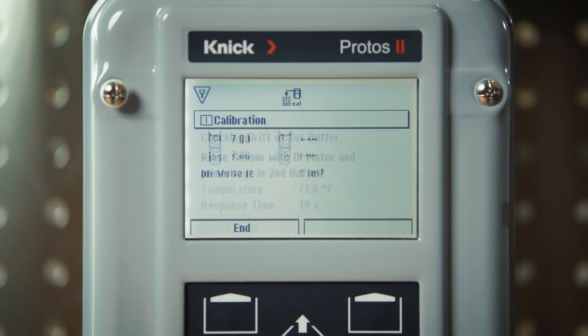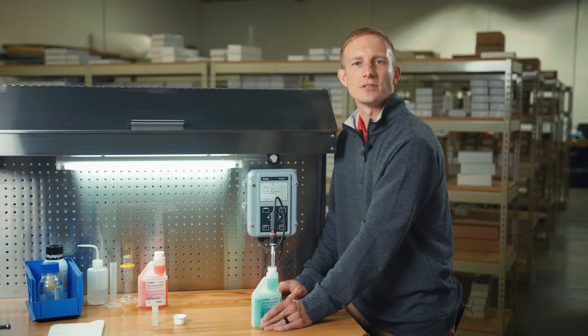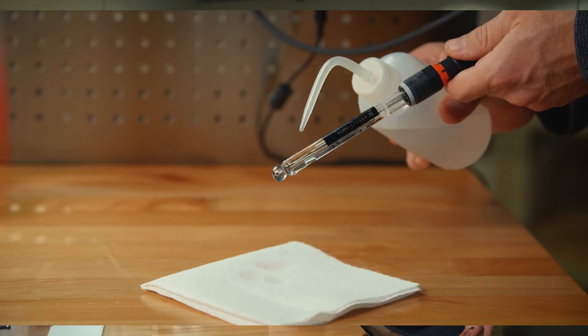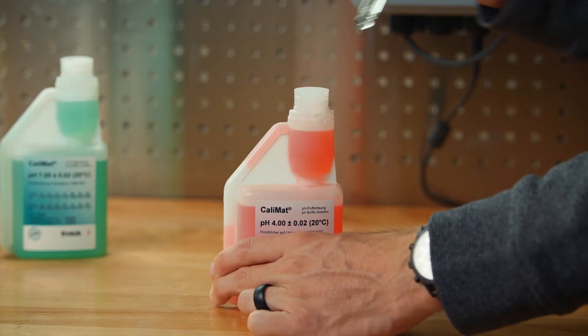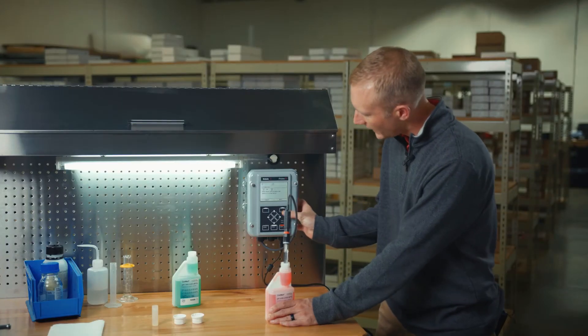Once finished in the first buffer solution, the transmitter will prompt you to once again rinse the sensor and immerse it in the second buffer solution. We will do so and then place our sensor in the buffer 4 solution. Again, stir lightly and then press next to proceed to the next step.